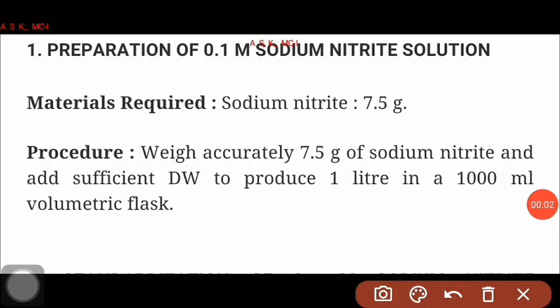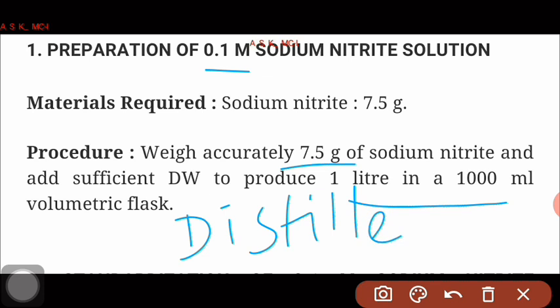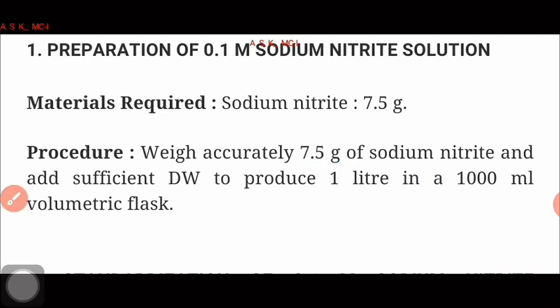Preparation of sodium nitrite solution 0.1 M is very simple: 7.5 gram dissolved in 1000 ml of distilled water. It is dissolved in distilled water and made up to the volume.